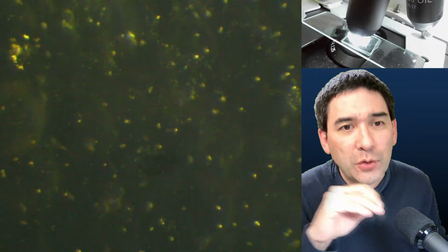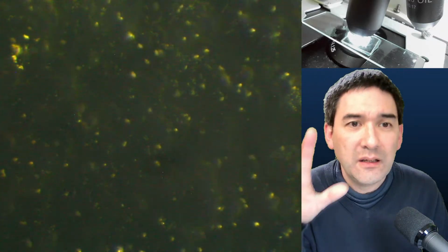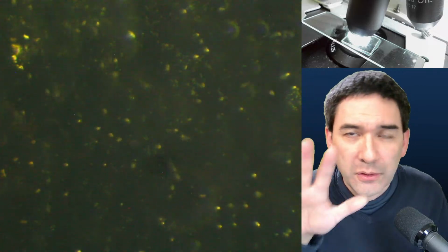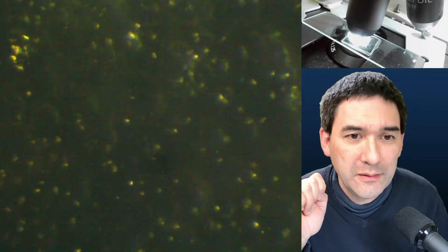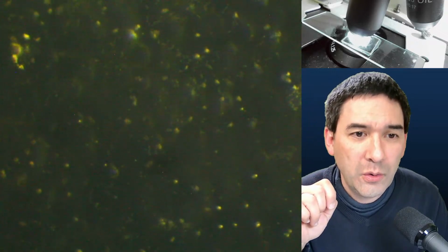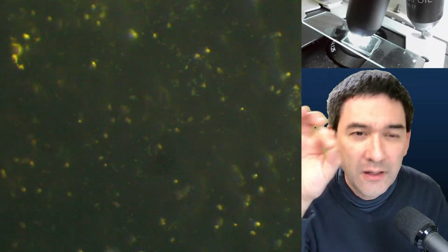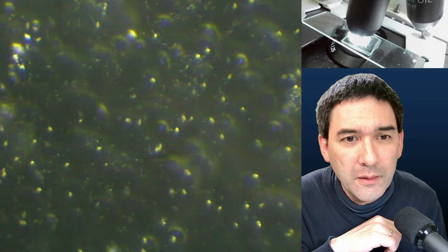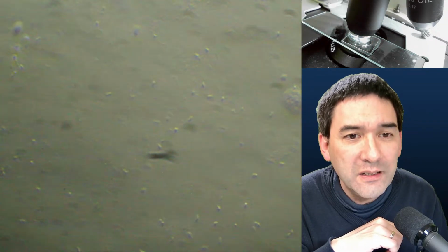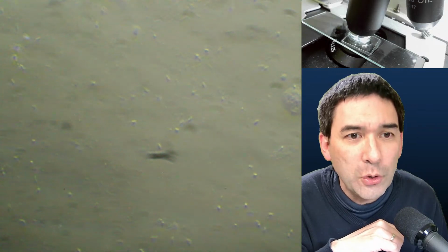The reason is that those bacteria that are out of focus still create a bit of a fuzzy, blurry image, and this disturbs the image quality a little. Only those that are really in focus are actual dots; all of the others make this cloudy, fuzzy appearance. But in oblique illumination you don't see that so much, and you get a more flat image. Those bacteria that are out of focus, you do not see them at all.